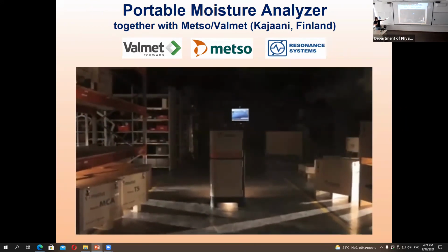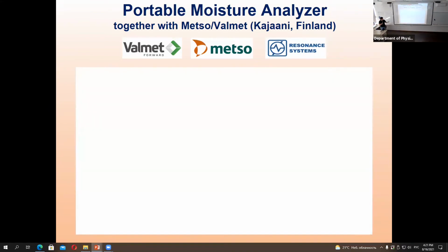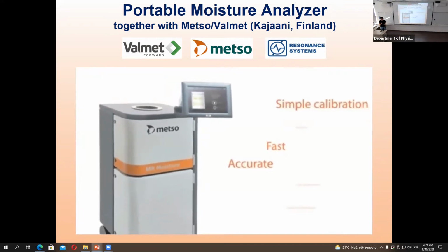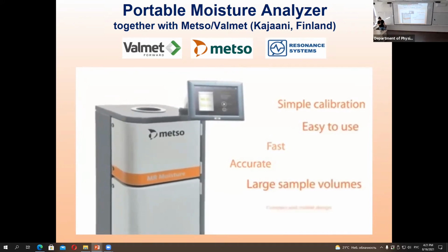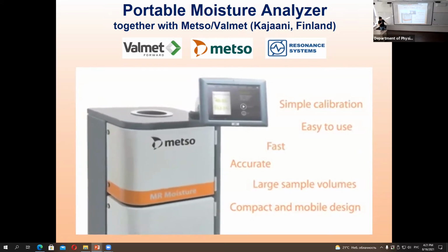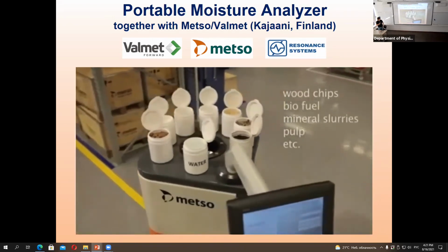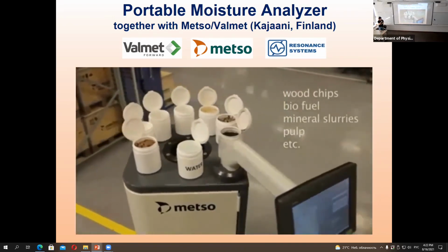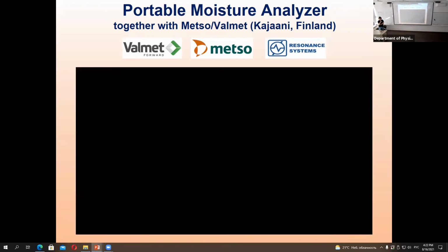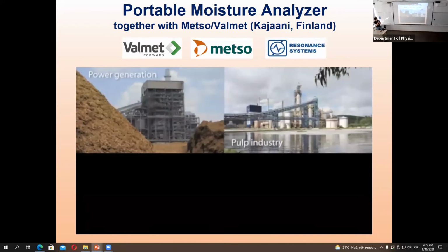Here you can just see the industrial applications of time-domain NMR. They have their own magnet, an electromagnet, 750 kilohertz. Such a big magnet, and they put there, you will see. You know, Finland produces electricity out of wood. They don't have gas. That's why they burn lots of wood.